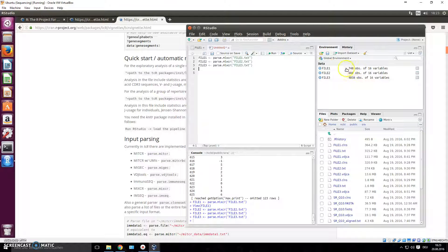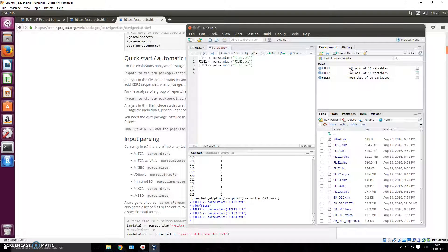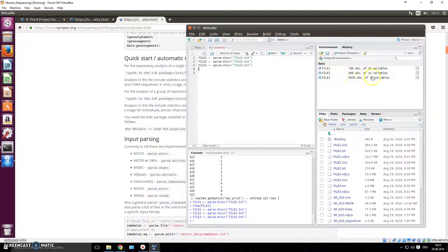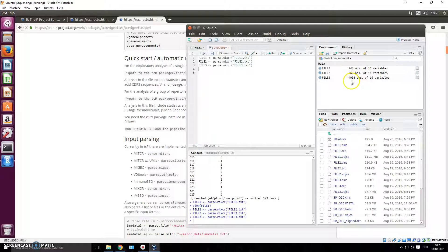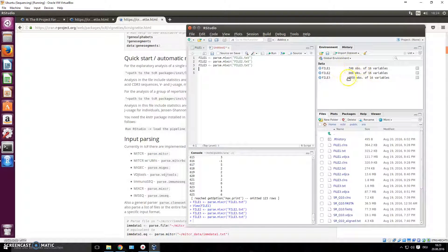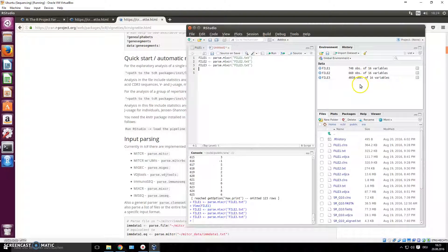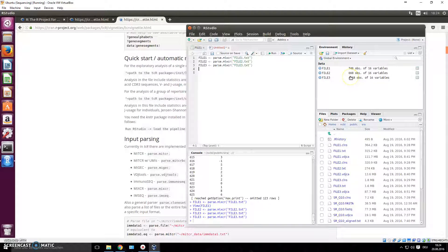So now we have these three files here. You already get some information on it - like this file has 748 rows, so lines, and that also means clonotypes in this case. So you have 660 clonotypes and here you have 4,058 clonotypes.